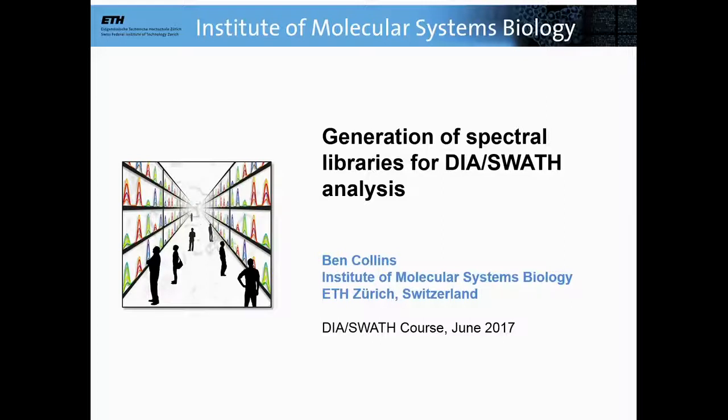So what I'm going to talk about now, so we mentioned earlier that at least in the way that we have been analyzing the data for the last few years in Zurich and also some others, we depend on prior knowledge in the form of spectral libraries in order to analyze the DIA or SWATH data. And this usually means some kind of classical DDA-based characterization of the samples that we're interested in.